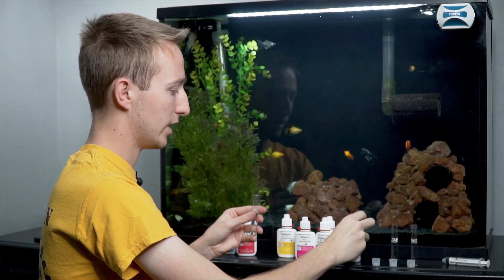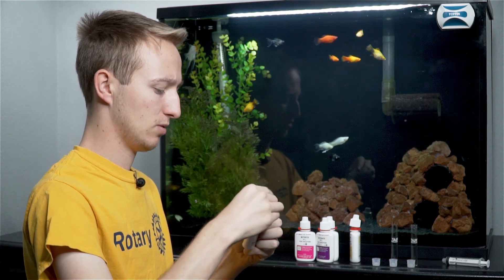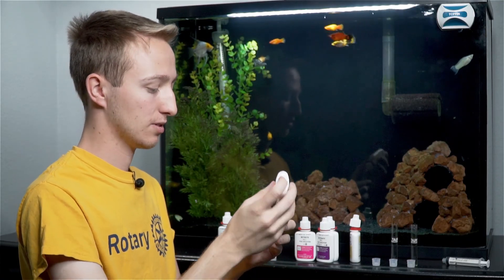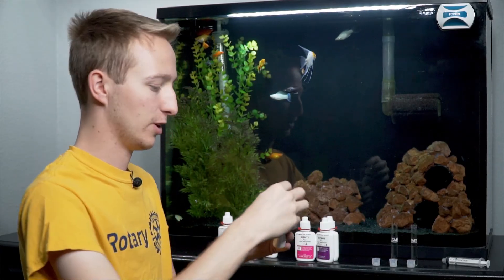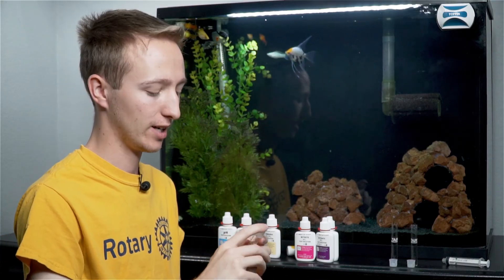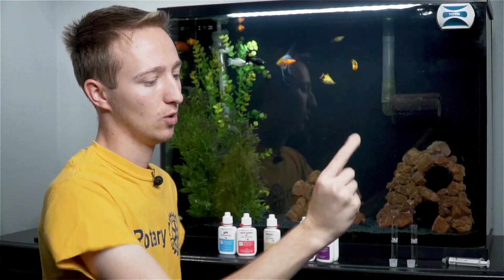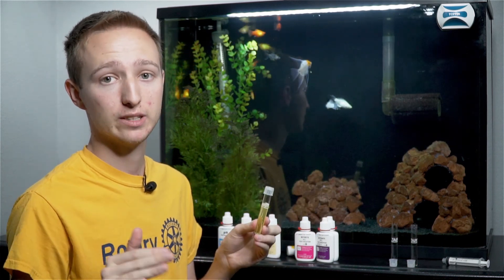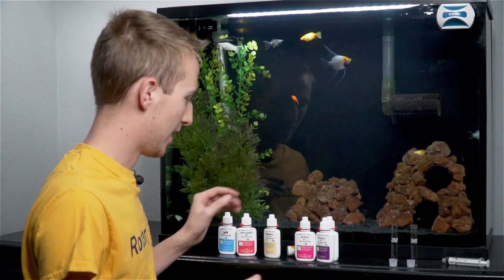Now that there are eight drops from bottle number one in, I'm going to uncap bottle number two and give it a little shake, then add eight drops. I recap both bottles so I don't spill them, then cap the test tube. This one you're supposed to shake vigorously for five seconds. I like to hold it nice and tight since the caps aren't 100% watertight. One, two, three, four, five. This is a timed one — you have to let it sit for five minutes, so I set a timer.